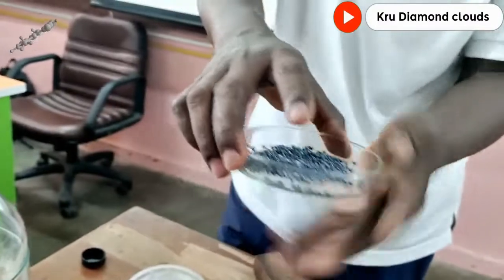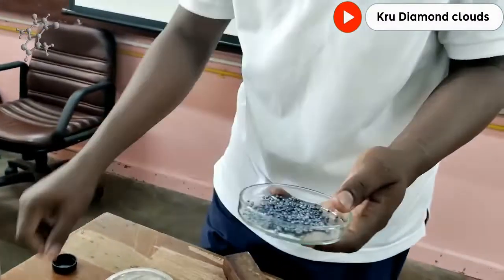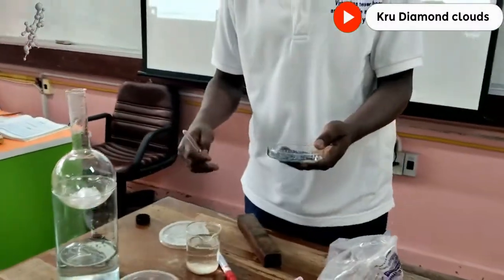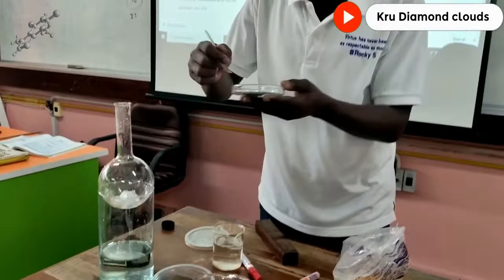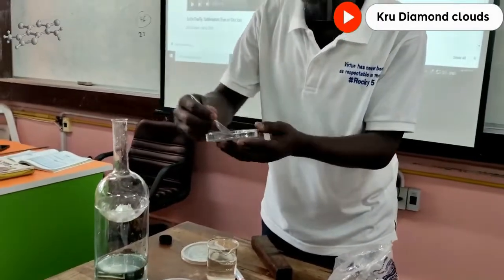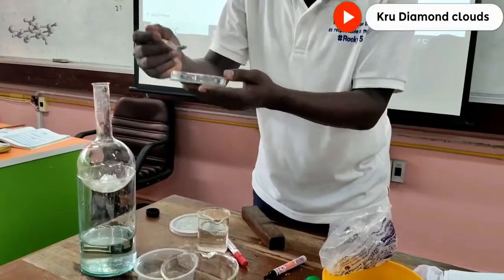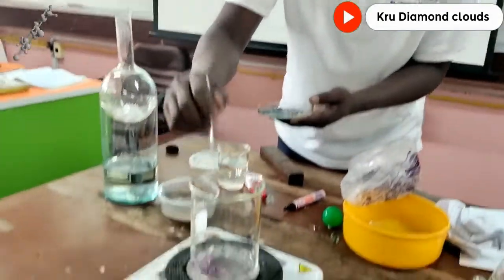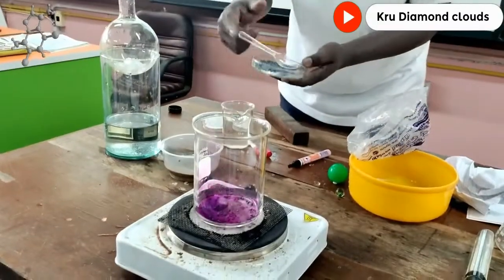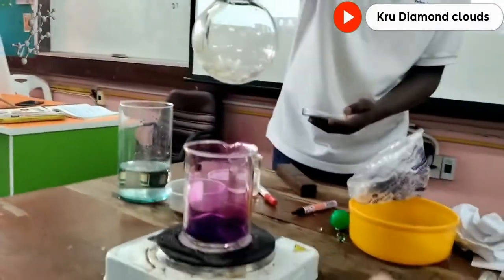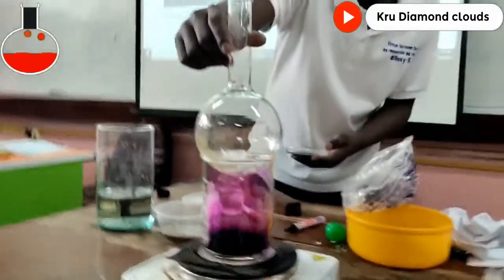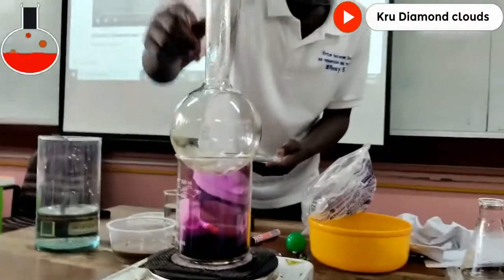And what we are doing is called deposition. So this crystal here, I'll put it in here, because I want it to change into gas. And now I'm going to change it into gas. You see? It is changing into gas.